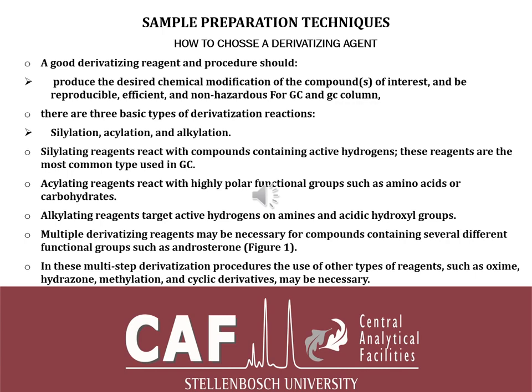Just to stop there, for instance, when you derivatize with any TMS, trimethylsilane, you should never ever inject those samples onto a polar column, because you will definitely damage the column. So when you're doing silylation, you have to use a non-polar column. There are three basic types of derivatizing reaction: silylation, acylation, and alkylation.